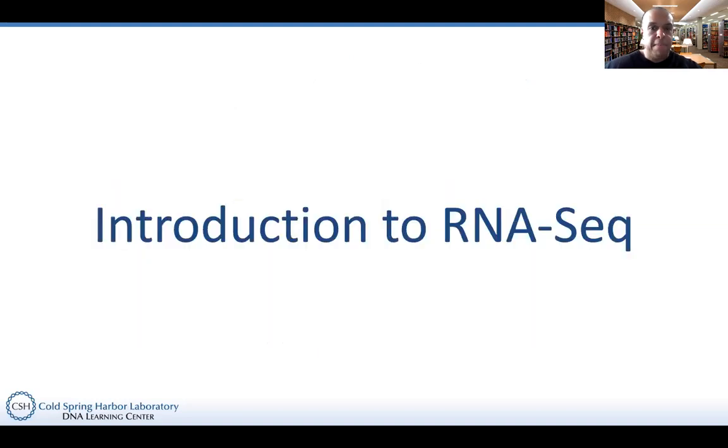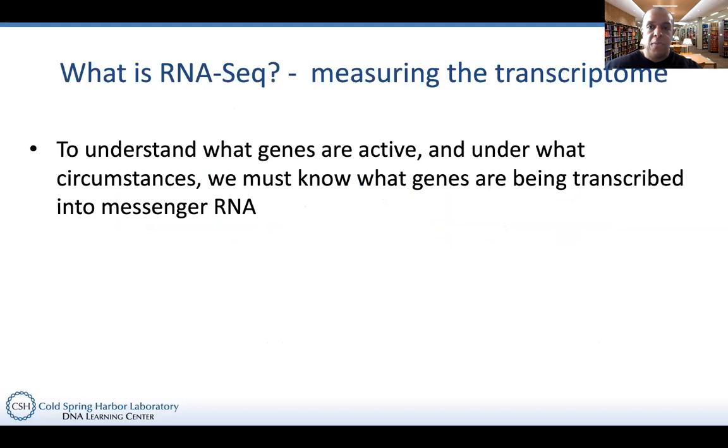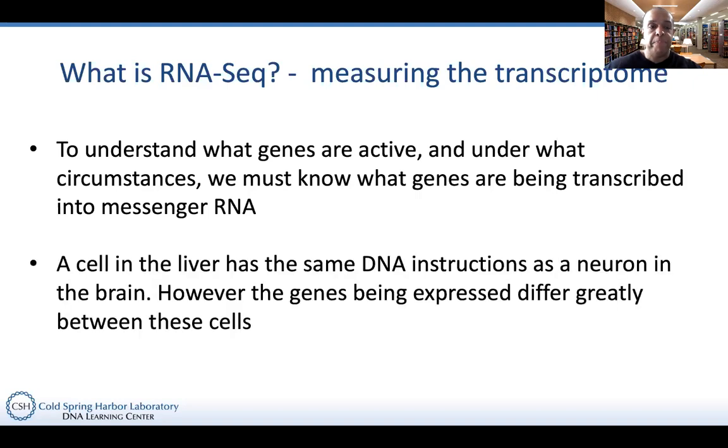Okay, let's recap the introduction to RNA-Seq. The RNA-Seq experiment, again, is extremely useful, popular, and common in molecular biology. It's one of the key technologies that we use to really understand what's going on. And as this bullet states, if we want to understand what genes are active and under what circumstances, often that means that we have to know how they're being transcribed into messenger RNA.